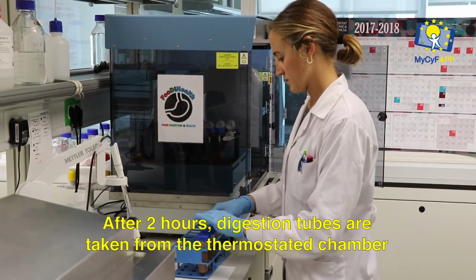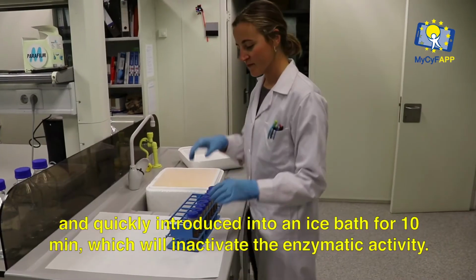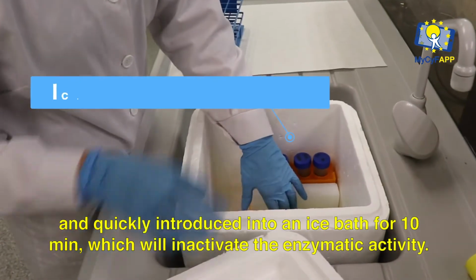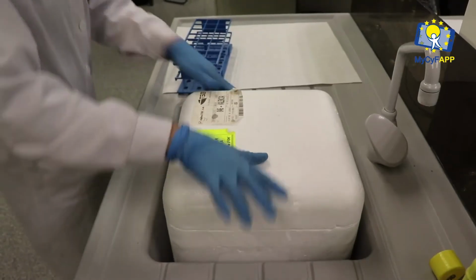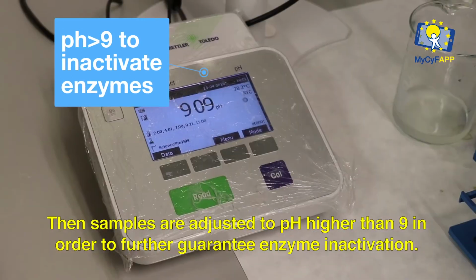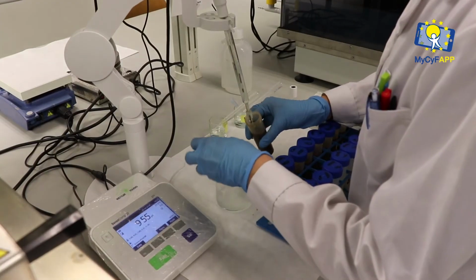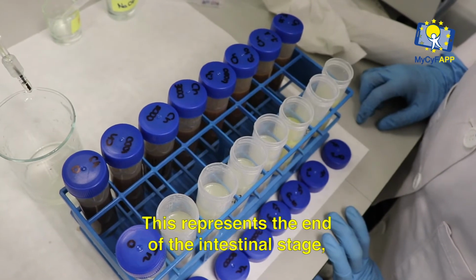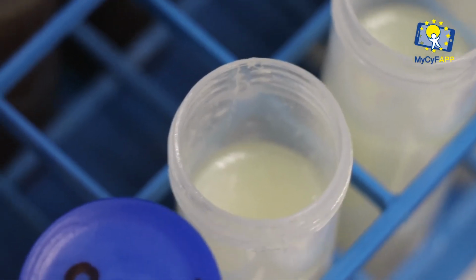After 2 hours, digestion tubes are taken from the thermostated chamber and quickly introduced into an ice bath for 10 minutes, which will inactivate the enzymatic activity. Then samples are adjusted to pH higher than 9 in order to further guarantee enzyme inactivation. This represents the end of the intestinal stage, therefore the end of the in vitro digestion process.